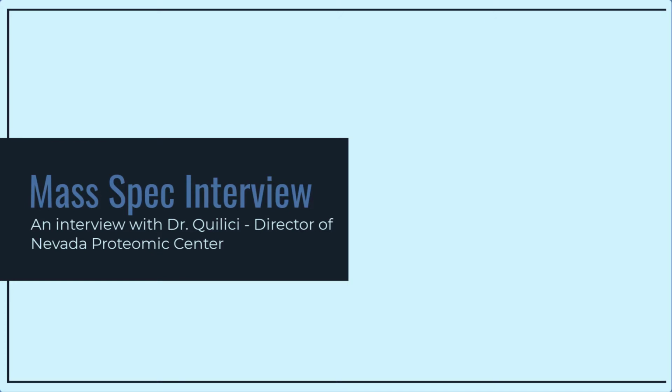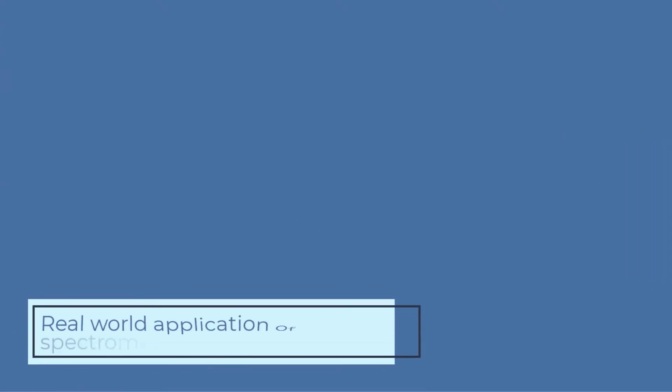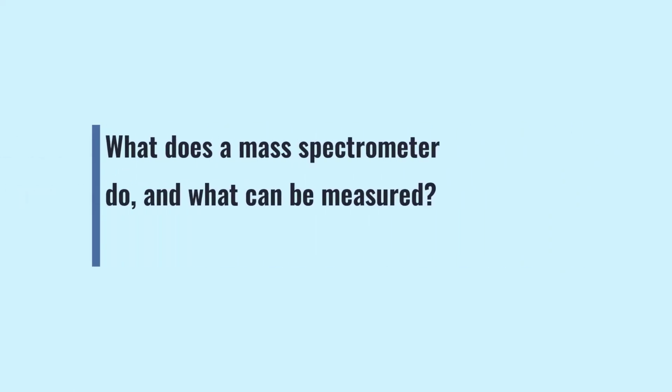In this video, we interview Dr. Quilici, the director of the Nevada Proteomics Center, to gain a deeper understanding of real-world applications of mass spectrometry. First, we asked what a mass spectrometer does and what can be measured.